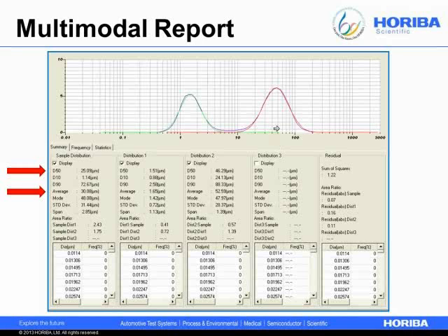And when this can be misleading is we've seen cases, not necessarily in the Trona industry, but just in general, we've seen cases where people who are supplying a material or a product which may exist in a bimodal state will send only one or two or three specs with it. So they might say the D50 has to be between 22 and 34 microns. And in this case, this material would pass.